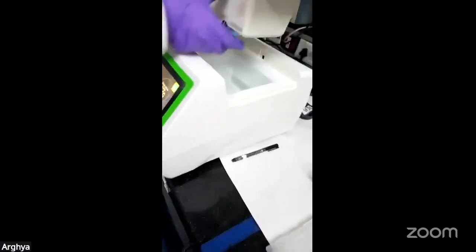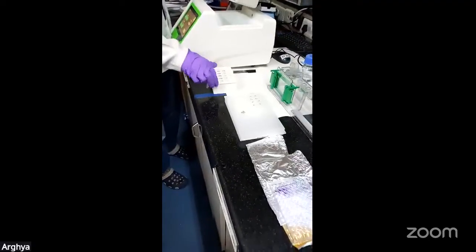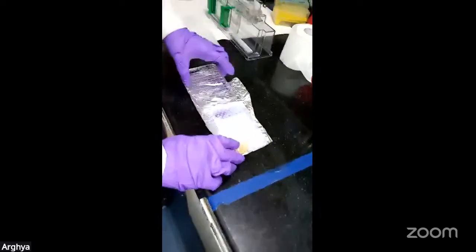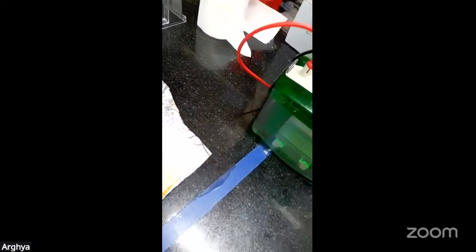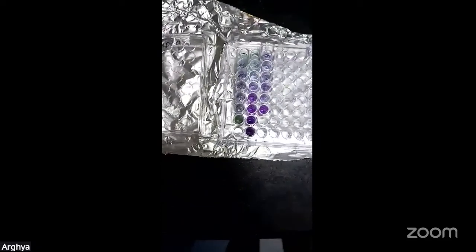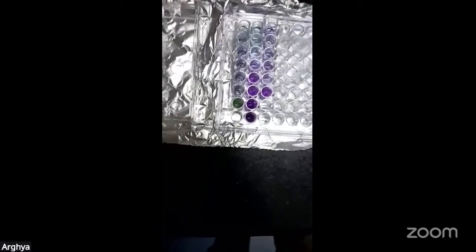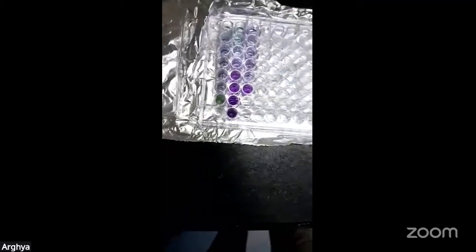Once the sample lysis is done, you quantify your samples with the help of Bradford. This is a standard plate. I have put the colors; a 96 well ELISA plate you can use. You can place your known samples or the standards in one of the wells, followed by your lysate, and then you put around 200 microliter of the Bradford. This is how a plate looks like. Then follow the recommended protocol of 10 minutes incubation.